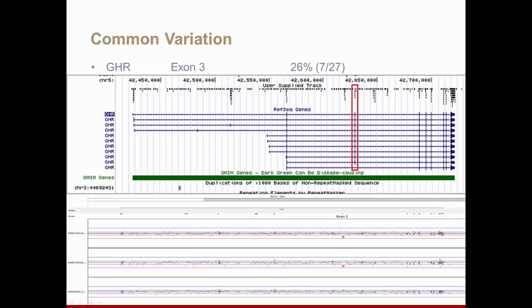And in this case, out of 4,600 genes, or about 4,500 genes by the time we eliminated, we had 4 regions of unexpected variation that appeared commonly. And these are, you remember, these genes are medically relevant, and we're looking for variations in coding regions. So when we see these variations, it is significant that we know how common they are.